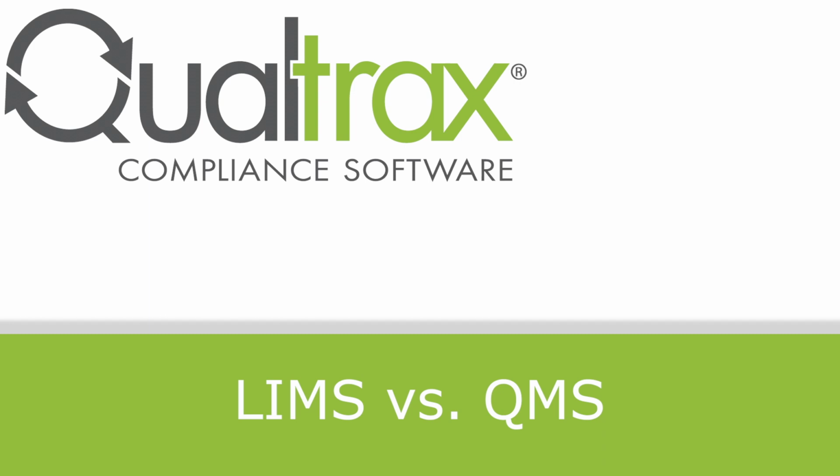We've seen laboratories in the news over the years lose their accreditation due to not following procedures or not having the proper checks and balances in place. This has cost them a lot of money, loss of jobs, and years of time to earn their credibility back. So it is worth paying the money to get these systems and processes up and running on the front end to eliminate the heartache and pain in the end. Both of these systems are an integral part of the overall quality of your laboratory. So do not try to cut corners.